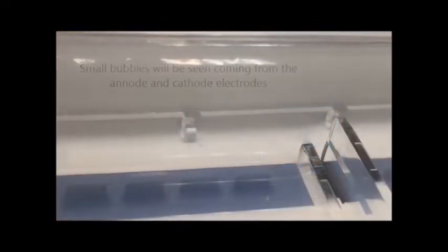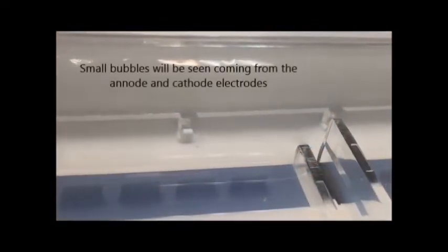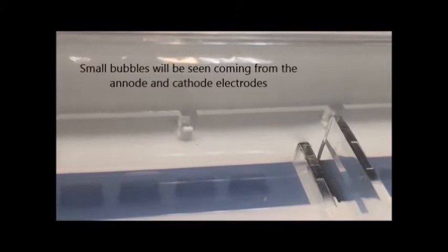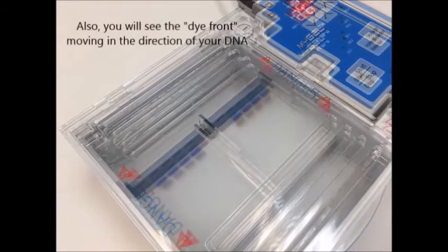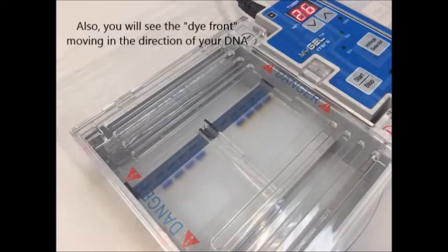When current is running through the buffer, small bubbles can be seen coming off of the anode and cathode electrodes in either side of the gel tank. Also, you will see that the dye front will be moving in front of your DNA.